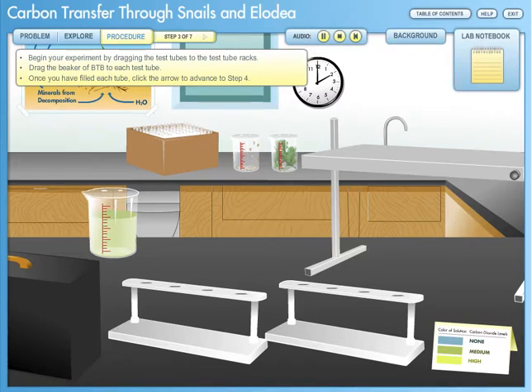Begin your experiment by dragging the test tubes to the test tube racks. Drag the beaker of BTB to each test tube. Once you have filled each tube, click the arrow to advance to step 4.